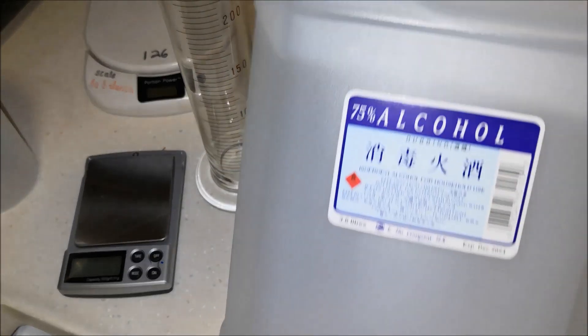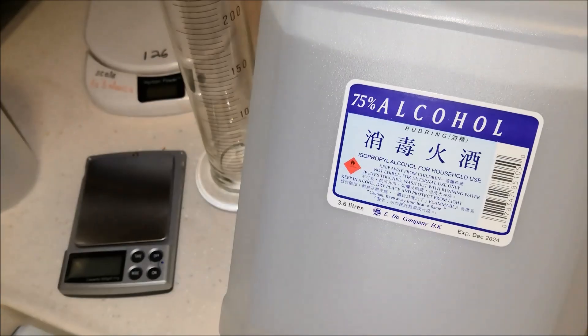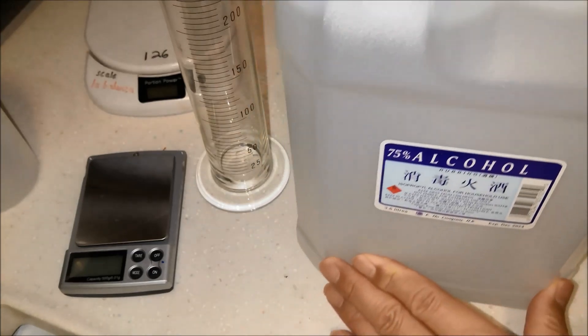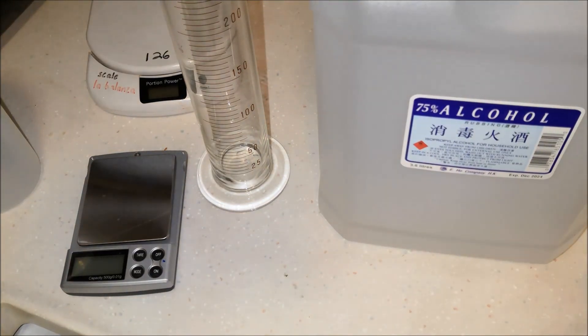Alright, so today I bought this jug of 3.6 liters of 75% isopropyl alcohol, and what I'm going to do is do some science here to find out if it's really 75% alcohol.